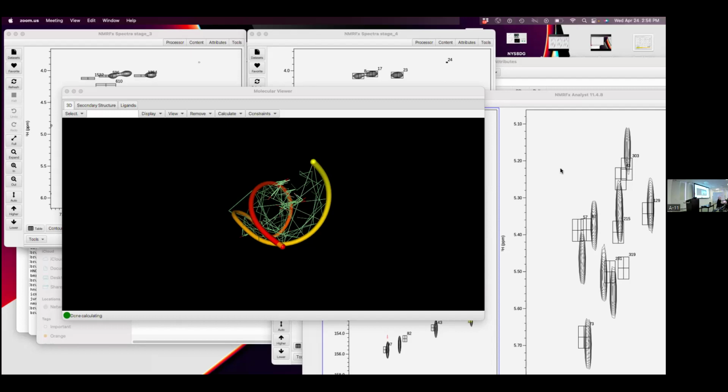We didn't talk about Ring, so I should mention, Ring is our NMR dynamics software. It does lots of RNA, it does CEST, it does CPMG, it does R1rho, with examples from some RNA work. In theory, you can process in NMRFx, use the Ring plugin, pick peaks in NMRFx, and then take the intensity of those peaks right into Ring. That's the theory, but we need more people playing with it and finding the problems.